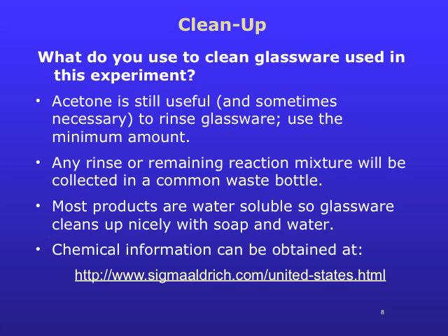A minimal amount of acetone should be used to clean your glassware. Any rinsing from cleaning glassware or remaining reaction mixture from your round bottom flask will be collected in a common waste bottle. A final washing of your glassware with soap and water is recommended.